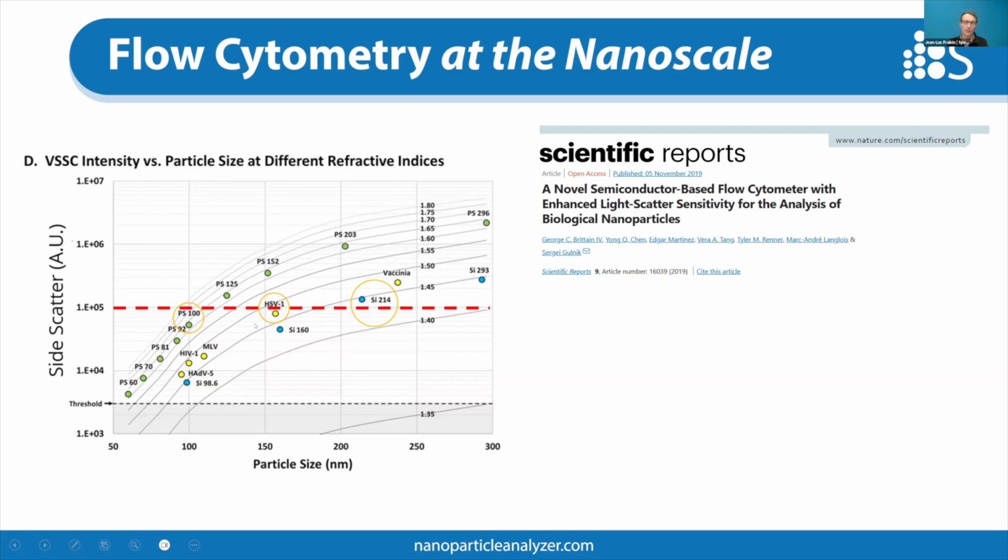refractive index. And as soon as you start mixing these together or end up in a biological system or even just a complex formulation where the particles have different refractive indices, it's impossible to get an accurate size and concentration distribution from scatter alone, okay?